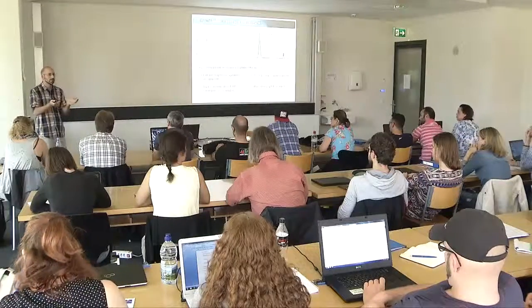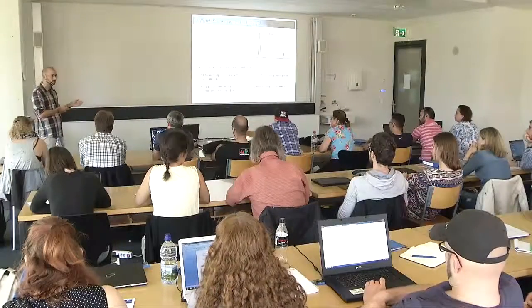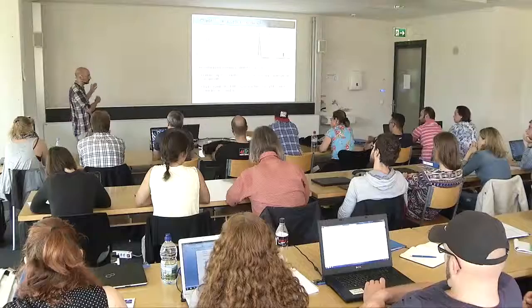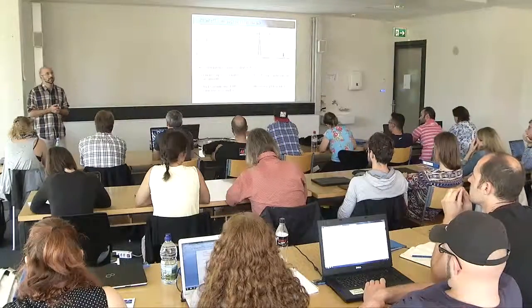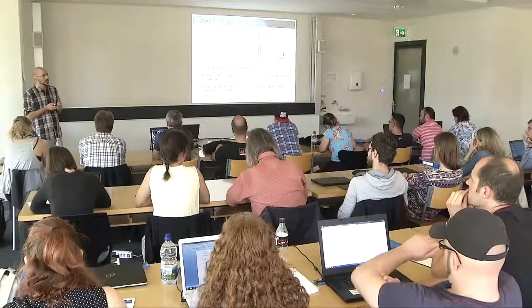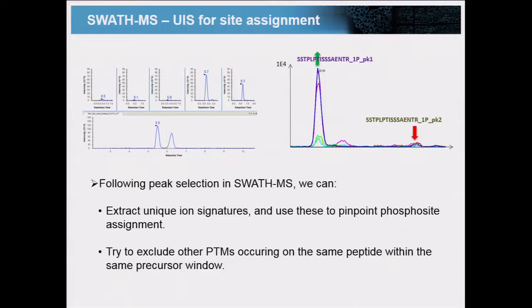In theory, as you've seen in Skyline, you can do everything related to this in Skyline, so you can extract all the series, for example, the Y-ion series, and figure out which ones are relevant. At the moment, what I do is I do it manually in Skyline. I'm not aware of a software that is publicly available.